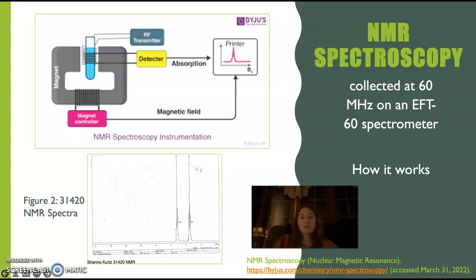What is NMR spectroscopy? NMR spectroscopy is when a sample is introduced to a magnetic field and light is shown through and then detected on the other side. It then produces the graph that is shown below in figure 2. As you can see, there are two spikes. Each spike is representative of hydrogen nuclei reacting with a magnetic frequency and the proton alignment.